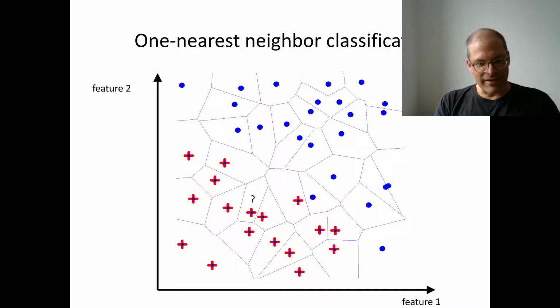If you have plenty of training data and plenty of compute power, then these days you want to use a deep neural network. If you have little training data and little compute power, then you would like to use something like boosting or random forest. And indeed, random forest is what we're going to use here and in the exercise.